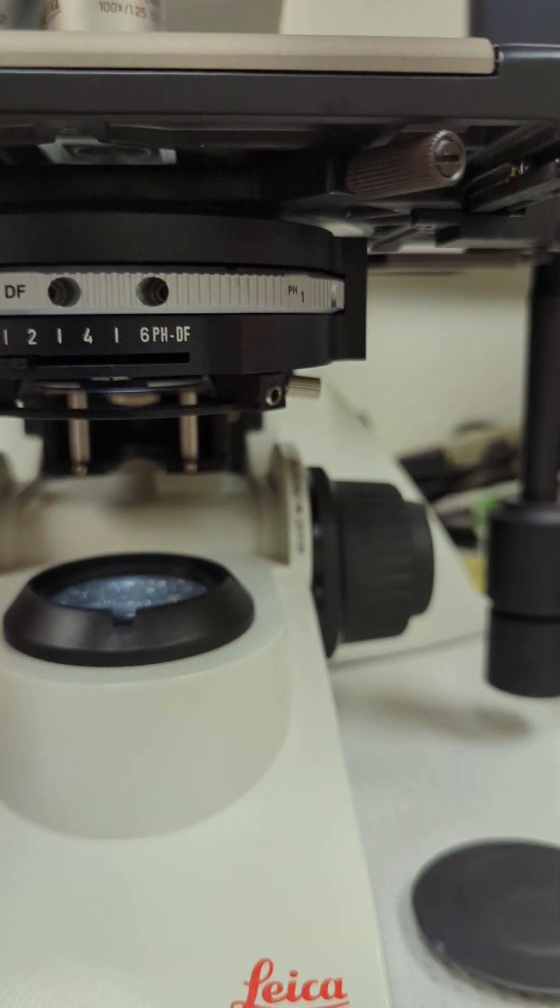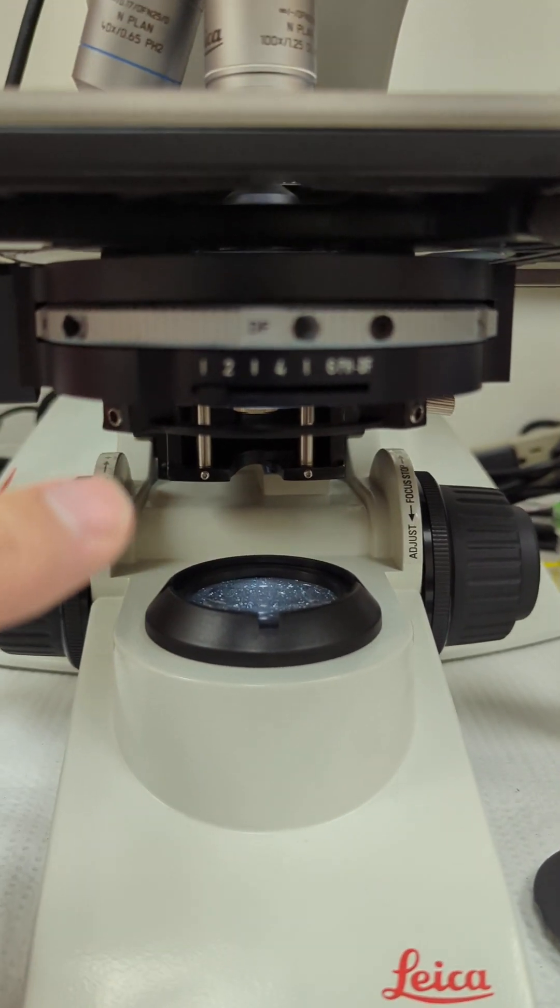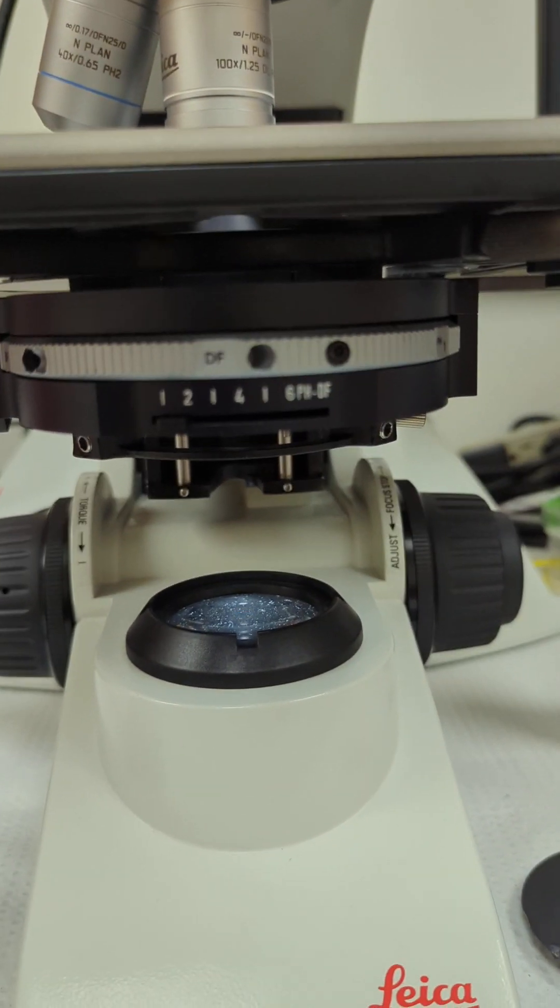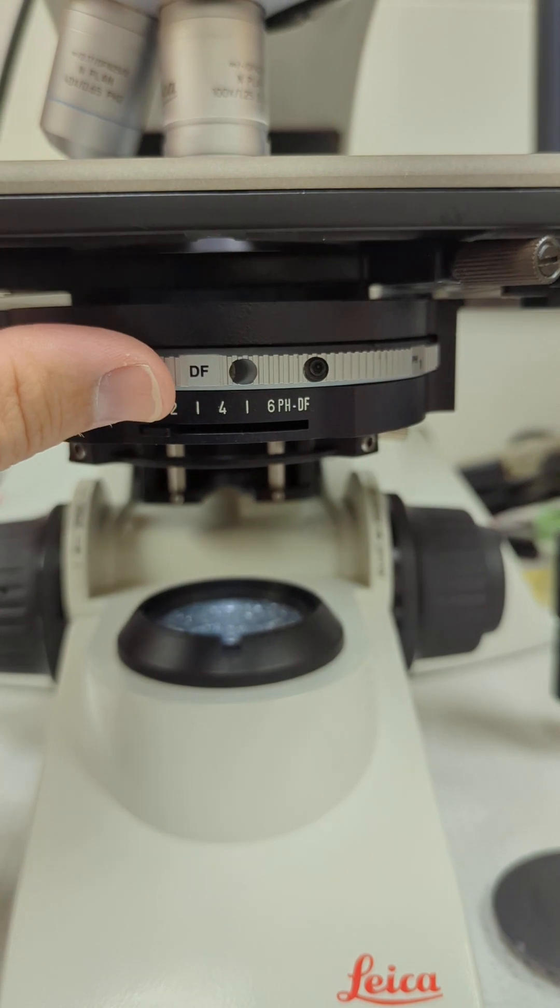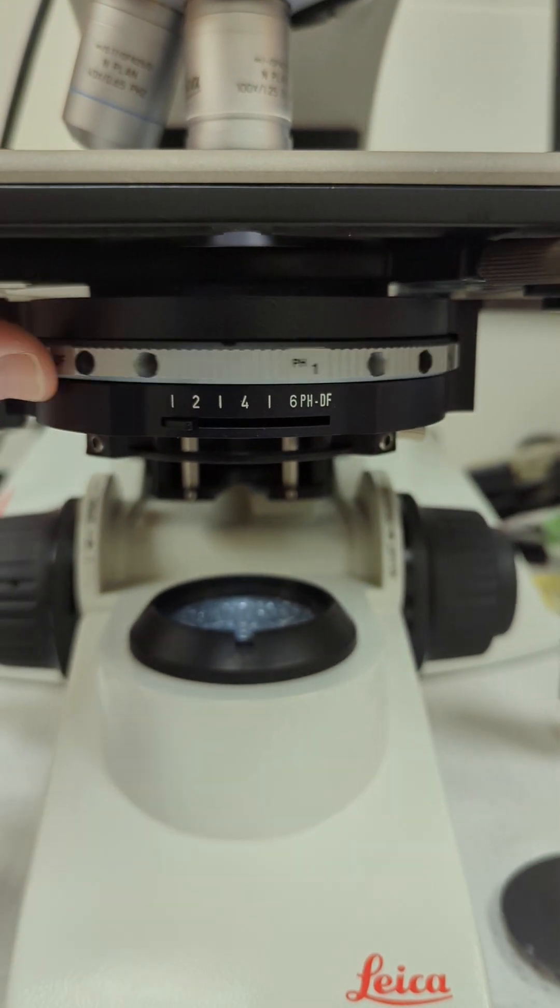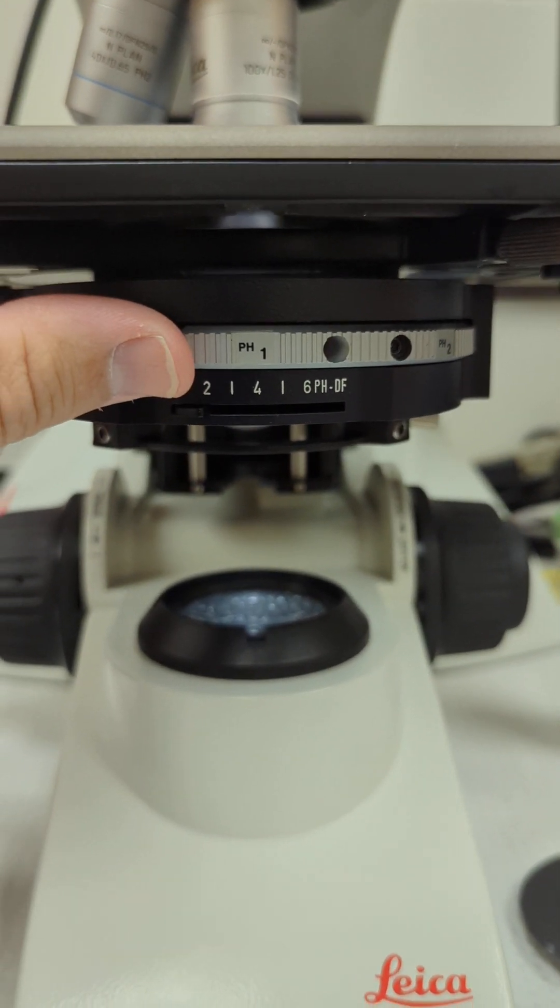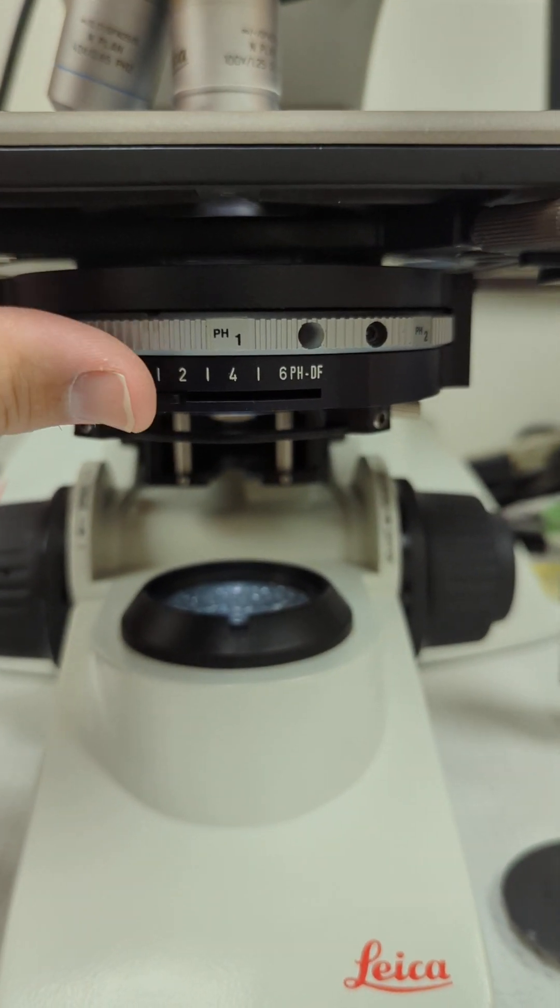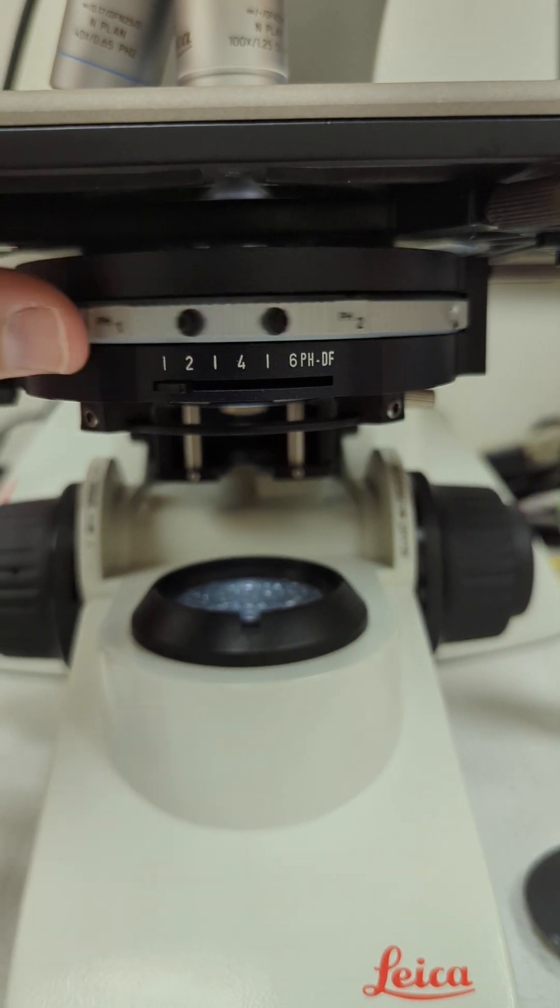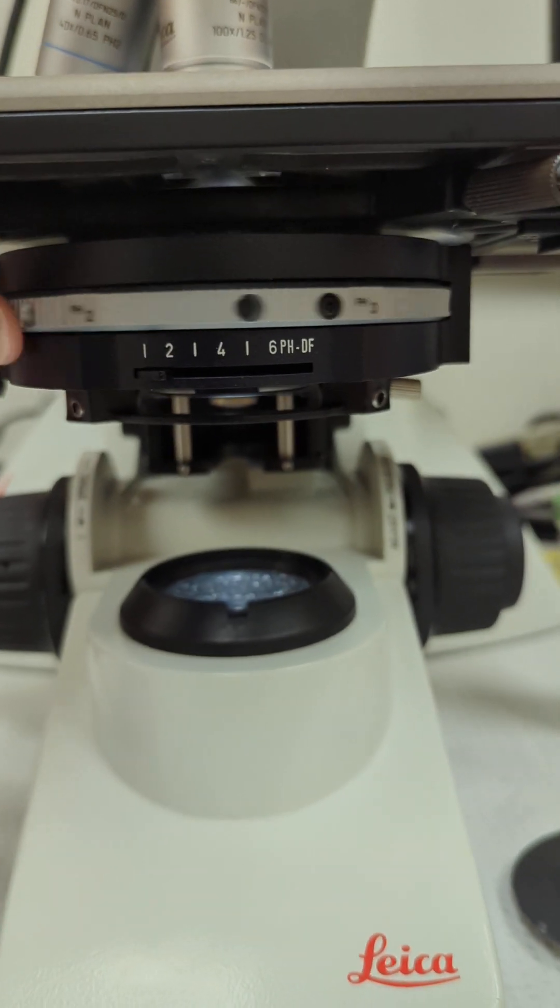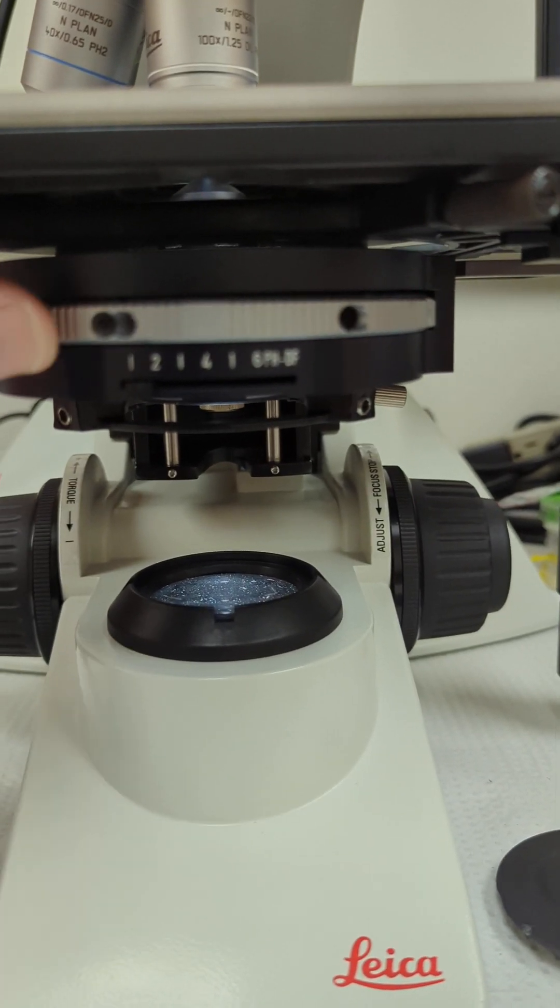You've got obviously brightfield right there. If you turn this turret, you've got darkfield, and then turn it again, you have phase one. So if you're using it in phase contrast, that's phase one, phase two, and phase three. Then it goes back to an empty spot and brightfield again.